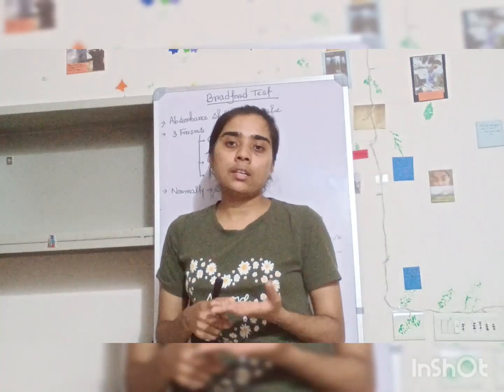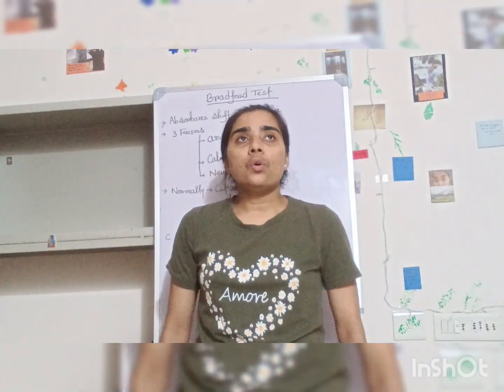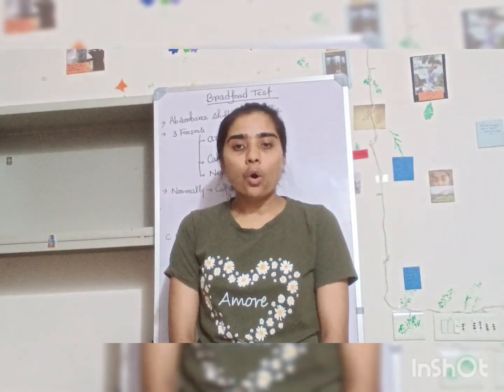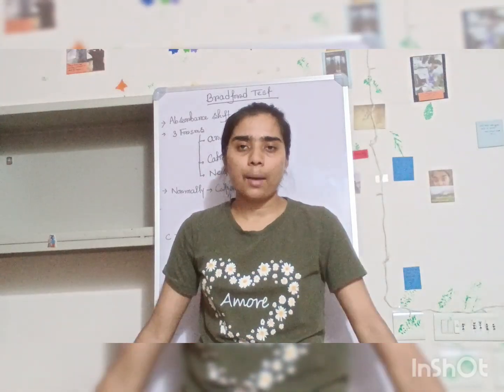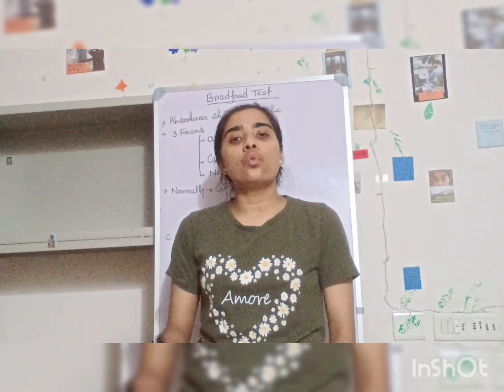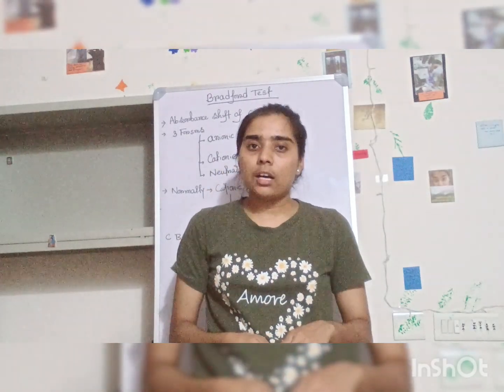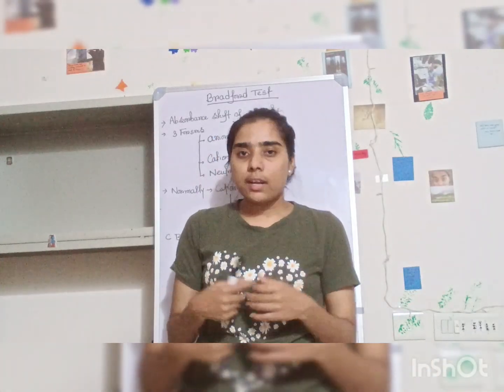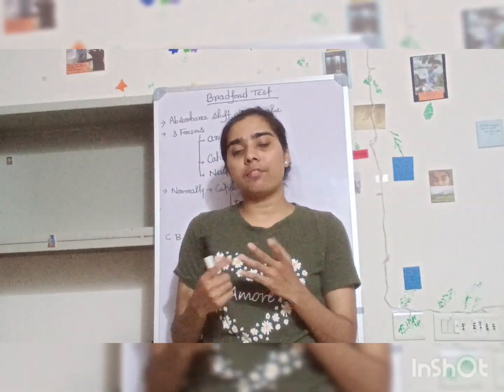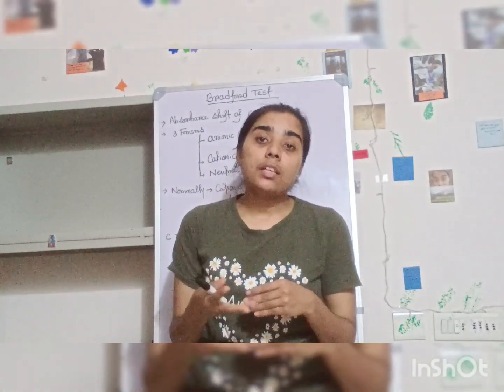Now the first question is why do we need to measure the concentration of the protein? The basic answer is, if you want to do any biochemical assays or any structural studies, any kind of assays in the laboratory related to protein, you need to know the concentration of your purified protein. Let's say for structural studies, in some paper it is mentioned that one protein got crystallized at a concentration of 15 mg per ml. Now you need to know how you can measure the concentration of your protein.